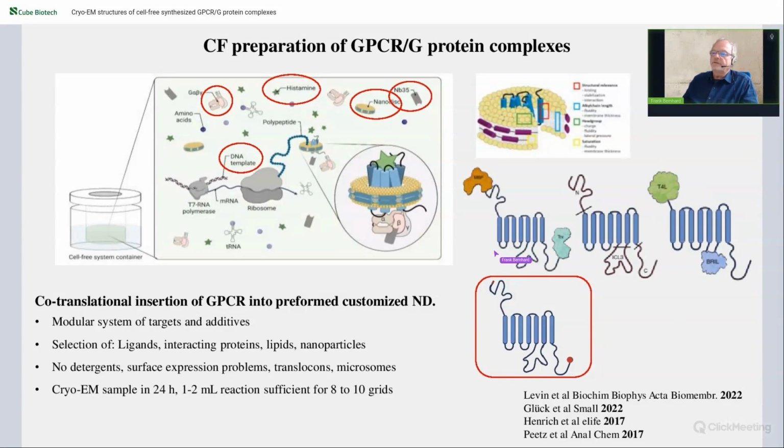And this is a very important difference to our cell-free system. We always synthesize the full-length protein. And it's only modified by a short C-terminal purification tag, a strep tag or a his tag, and by a short N-terminal initiation of translation tag, which is up to 6 additional codons.